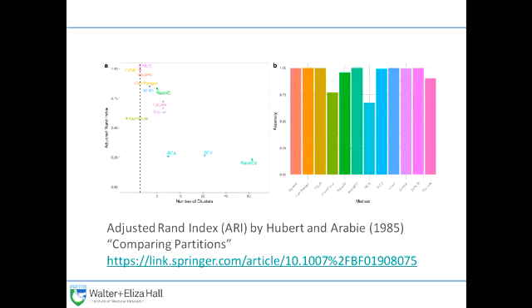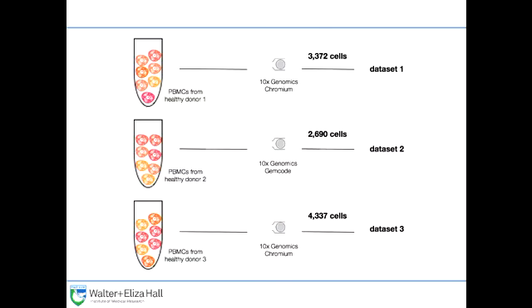So it's useful to know that if you're thinking about using RaceID2, it will have a tendency to find many, many more clusters than might be truly present in your data. On the other hand, this group of methods do pretty well in this particular data set and might be in the bucket where we think, oh, they're all plausible candidates.